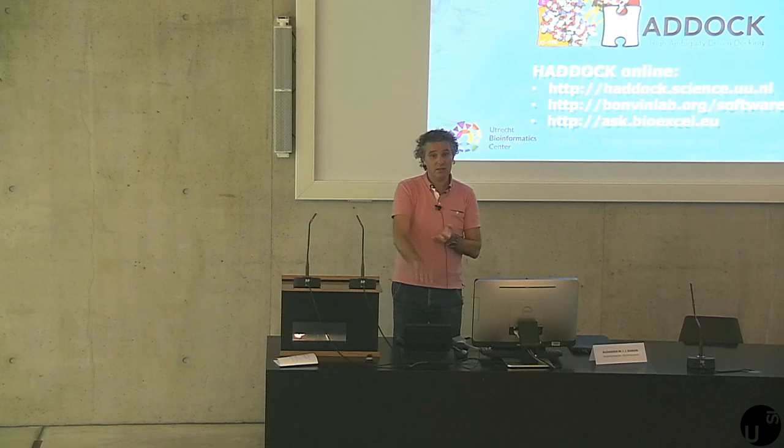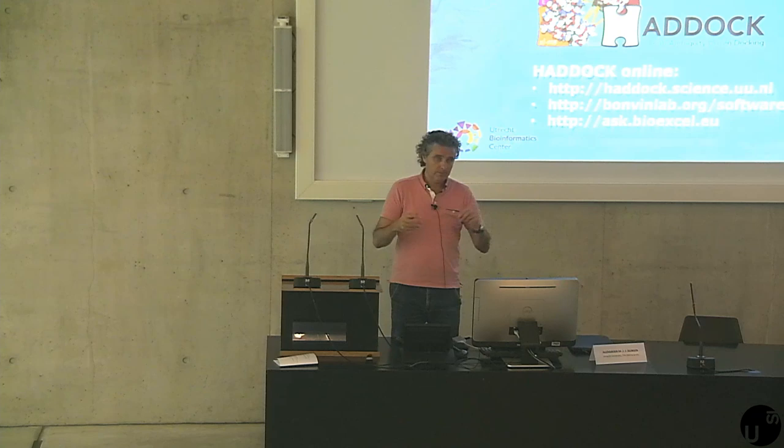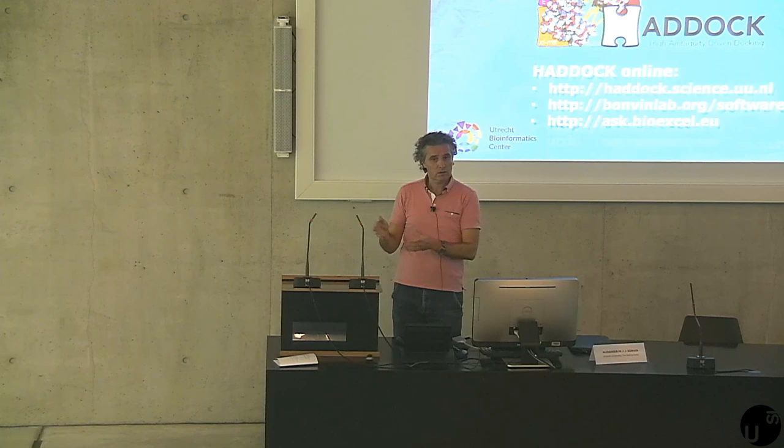So we use buried surface area instead of the van der Waals as a weight. And the weights are also changed because the treatment of electrostatic interactions is also different at different stages. So the default protocol will be that we scale down the electrostatics by a factor of 10 during our calculations when we are in the first and second stage. And when we go to water, we have the full electrostatics again. And this also affects the weight that you are using.